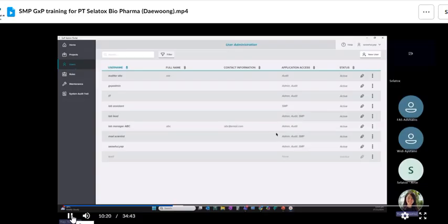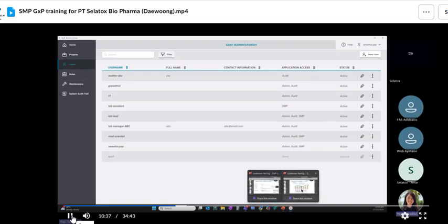If you log into your newly installed GxP admin as well as SoftMax Pro, you will see by default it will have a scientist role, as well as a lab technician role, and then a lab manager role, which is showing here.